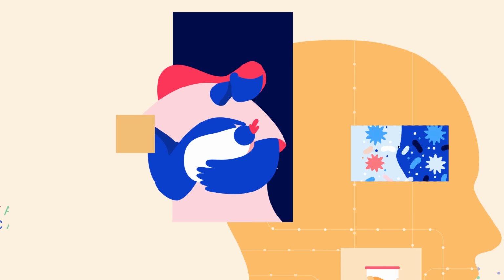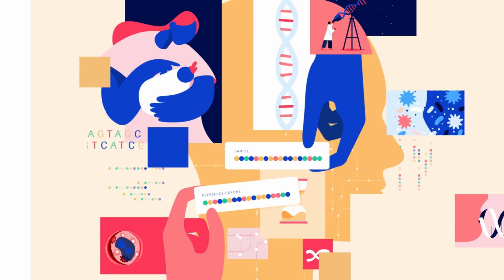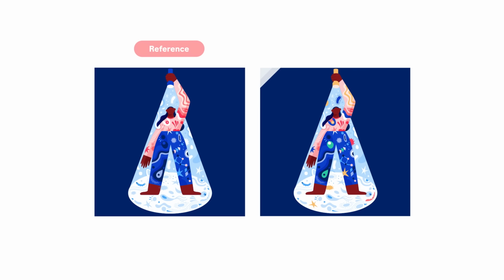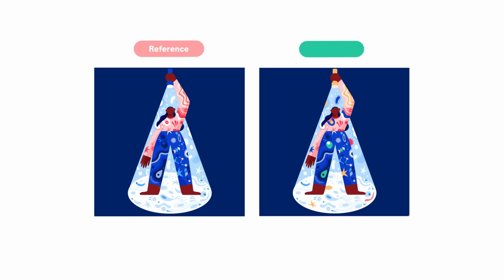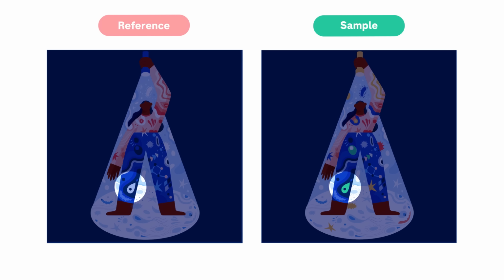for the next generation. Now, imagine DNA sequencing as a game of spot the difference. Your reference sequence is the original picture. The DNA from our sample is our difference picture. Our goal? To spot the differences between them. When you have both your reference and sample pictures together side by side, comparing them is very straightforward.